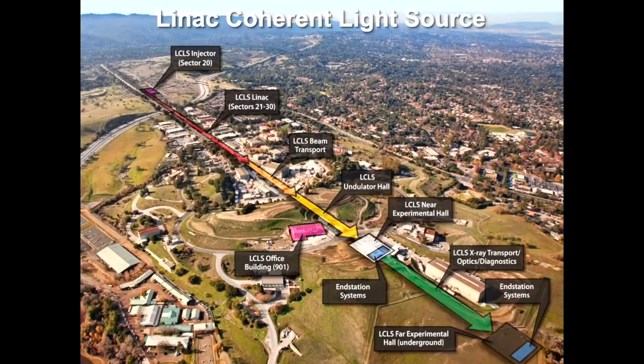All right, so this is what the X-ray laser looks like. Very different from the round machines that I showed earlier, right? We have a synchrotron here on site. It is one of the small ones because it's one of the first ones ever. It's over here. It's relatively tiny compared to the very long straight accelerator that we use to make the X-ray laser. This accelerator has been here for 50 years or more. Construction started in the early 60s.